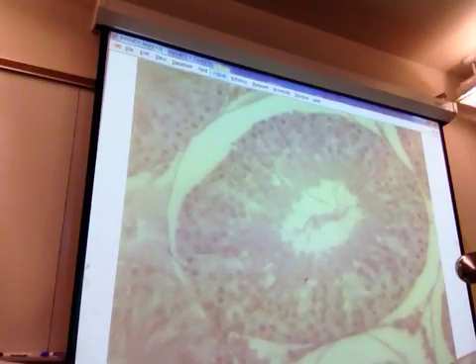Because I can't really tell the difference between that one cell's cytoplasm and, when you say it goes up, I mean, they all look like just I'm not seeing a real differentiation. It's just kind of training your eyes. So like here would be the spermatocyte. See, right where I'm drawing the line. And that's the cytoplasm of the spermatocyte? That's the cytoplasm of the spermatocyte. This is the nurse cell. Okay. And you can see its cytoplasm going like this, and stopping right about here.